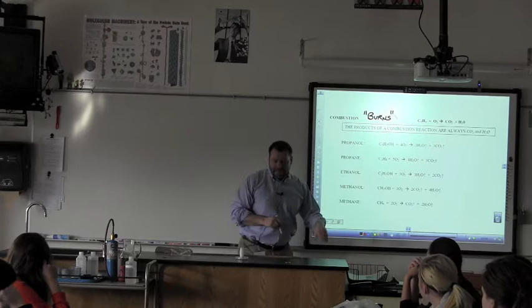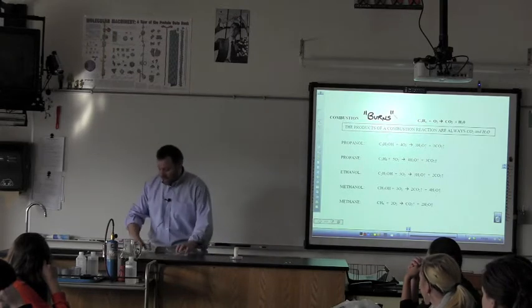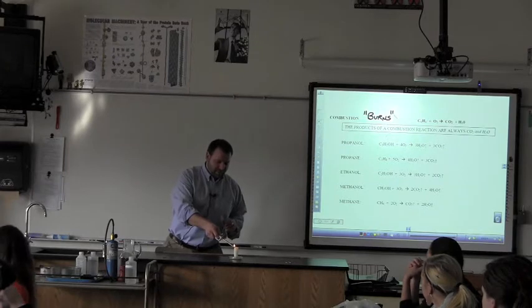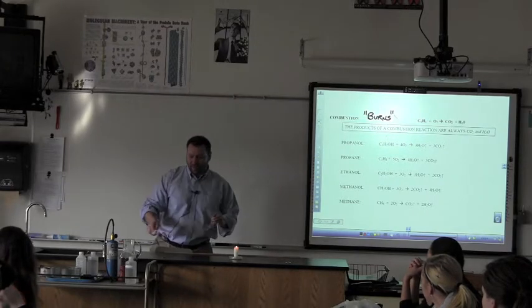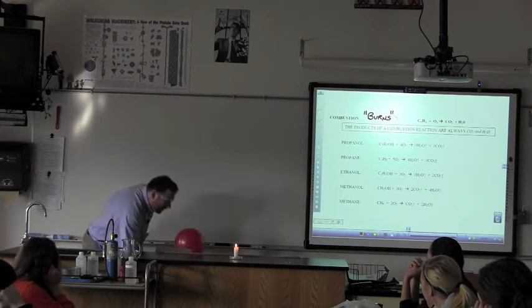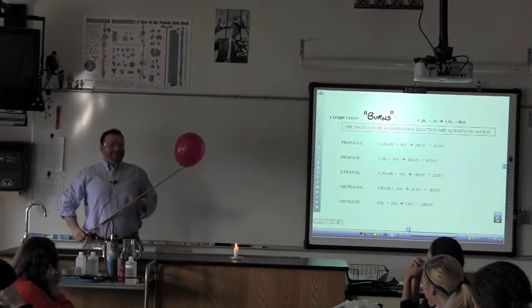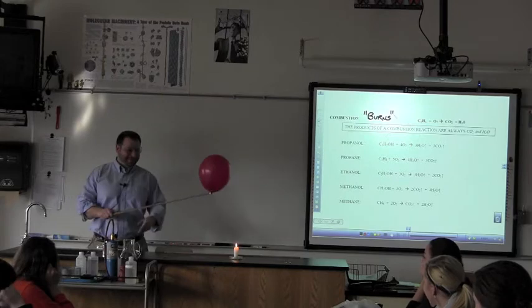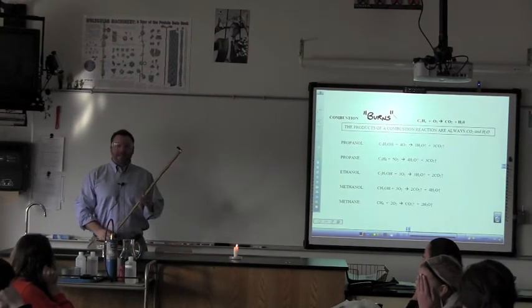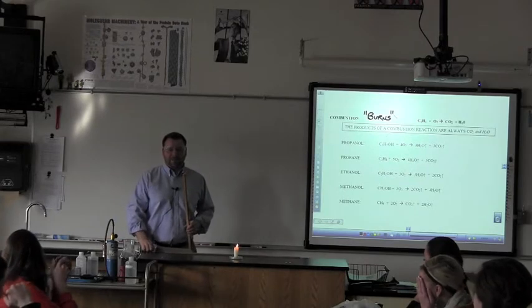All right, so let's kick it off. I have that other hydrogen balloon, so let's get going. Now you have a little bit of warning. Are you ready, Sammy? Okay, so here we go. This one's bigger too. Okay, ready? Nice. It's a nice combustion reaction, right?